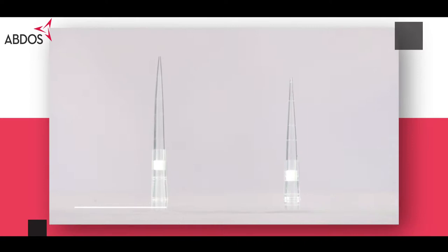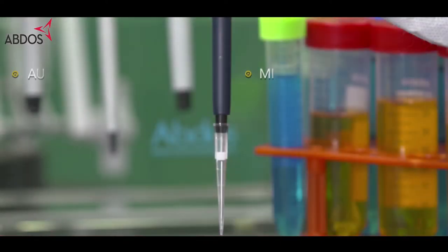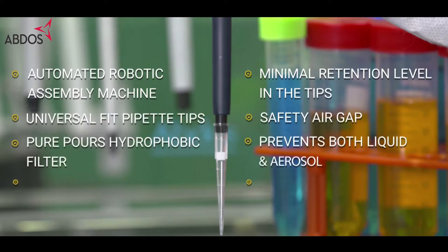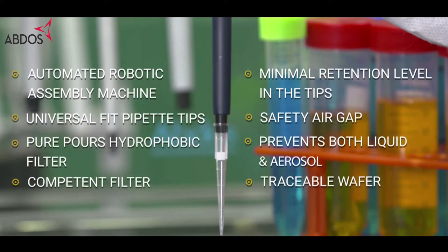In this video, you will be experiencing the finest pipette and super filter technology with ABDOS Last Drop low retention filter pipette tips. Here are a few unique features of ABDOS Last Drop low retention filter pipette tips.